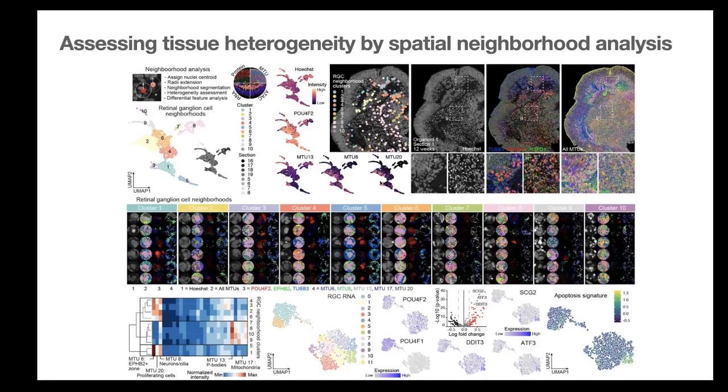And then, say, our inner-outer axis from the outside of the circle to the inside of the circle. And in the retinal organoids, actually, there's a deficiency, you might say. So the ganglion cells, which normally make connections to the brain neurons, at some point they die off. After 12 weeks, they're just vanishing. And we thought maybe we can learn something about the neighborhoods, and then I basically did the whole laminar analysis, but with nuclear radial neighborhoods.